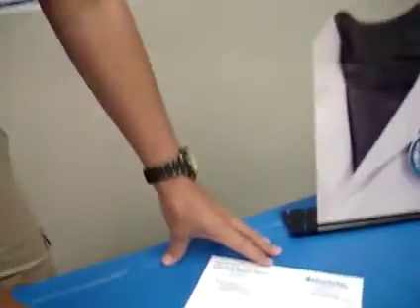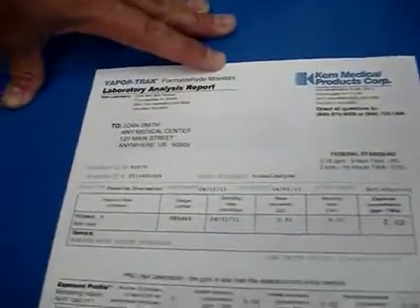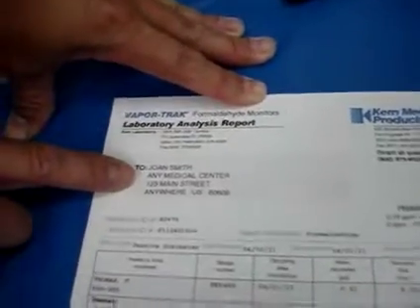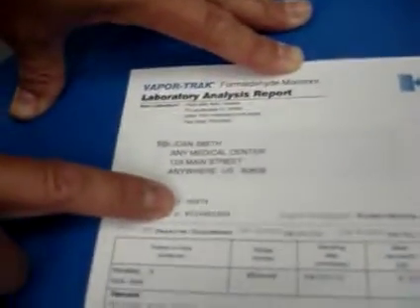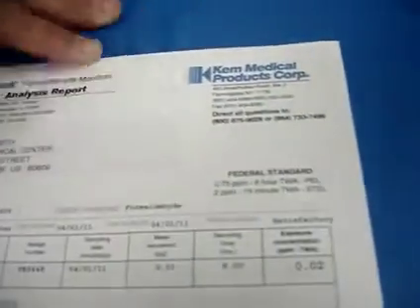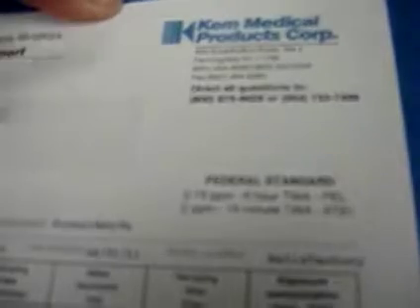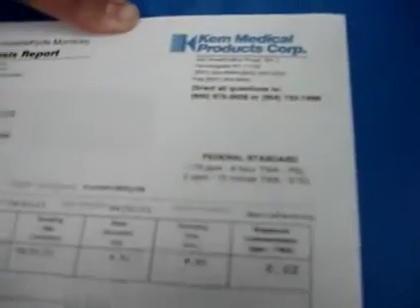Okay. After the badge reaches us, we'll send you an analysis report, a 1-page analysis report for each badge used. The information is going to have the institution, the account number for that institution for that chemical, and the federal standards on what's the maximum allowed levels. Like this particular analysis report is for formaldehyde. So it lists the 8-hour TWA, which is 0.75 ppm, and then the 15-minute STEL, which is 2 ppm.